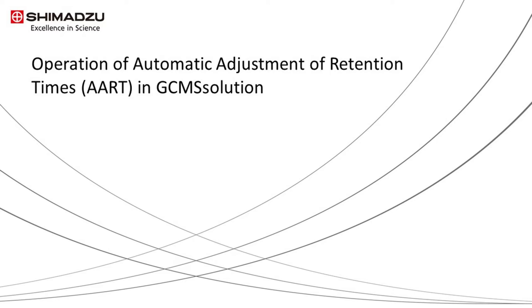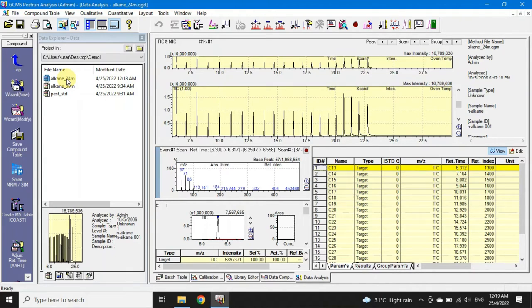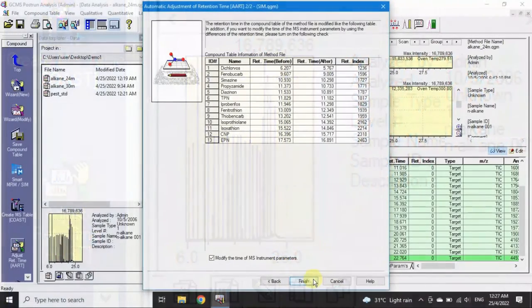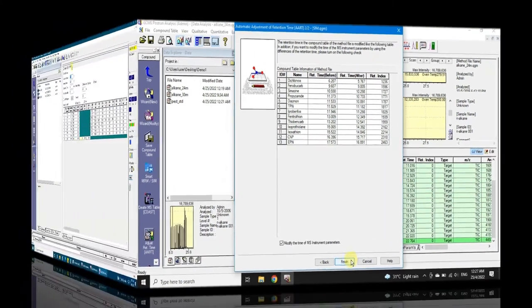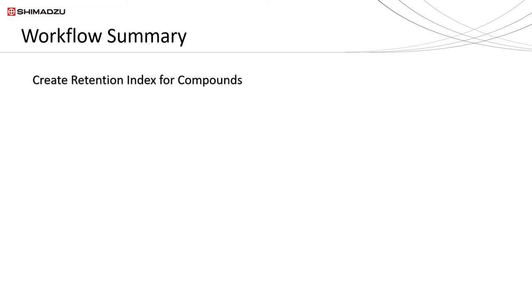Note that we only need to create the retention index of the compounds once; after that, we mainly use the AART function to update the retention time whenever we cut the column or move to a new instrument. To do AART, inject and analyze the n-alkane standard sample in the new instrument or after cutting the column. Once data acquisition is completed, load the newly acquired n-alkane data file and use the adjust retention time AART function to automatically update the retention of the target compounds and MS table start and end times.